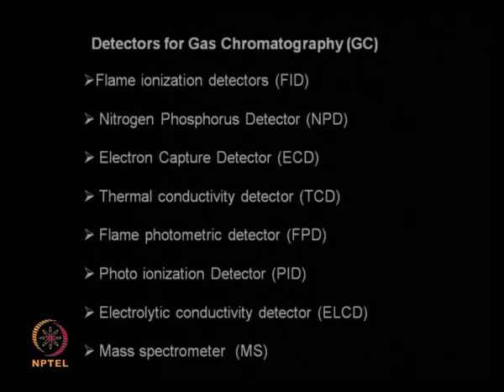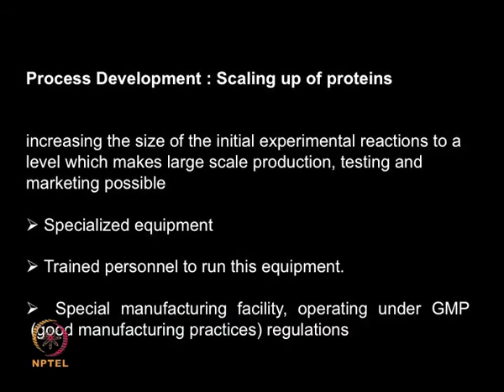So, depending upon the type of molecule you are studying, the situation, we can have different detectors possibly incorporated into your system. So, when you are scaling up proteins, let us go back to proteins again.